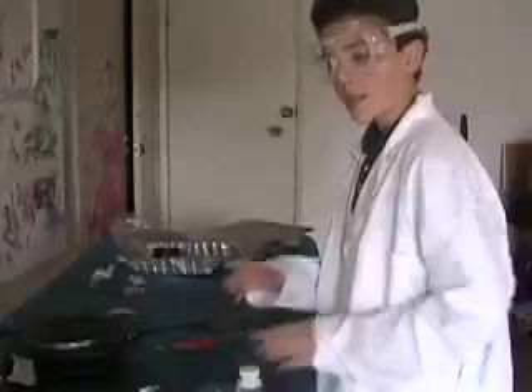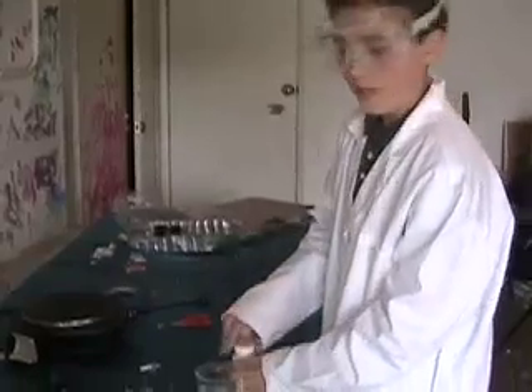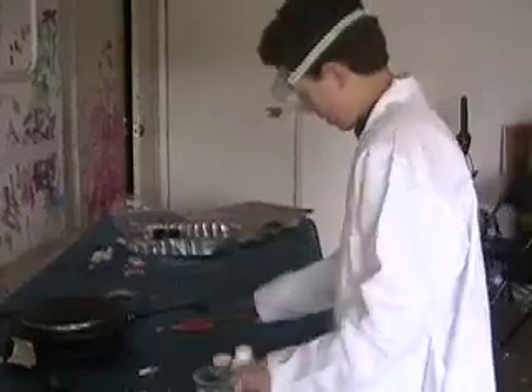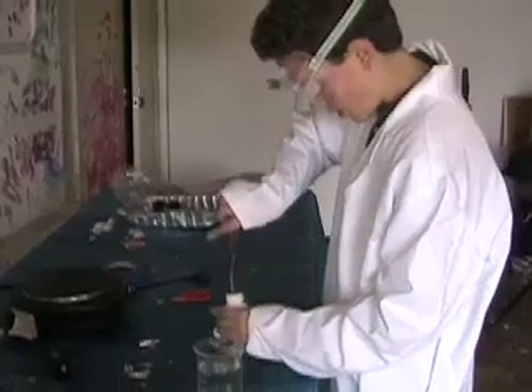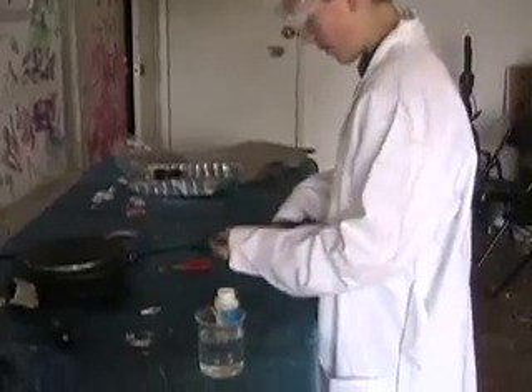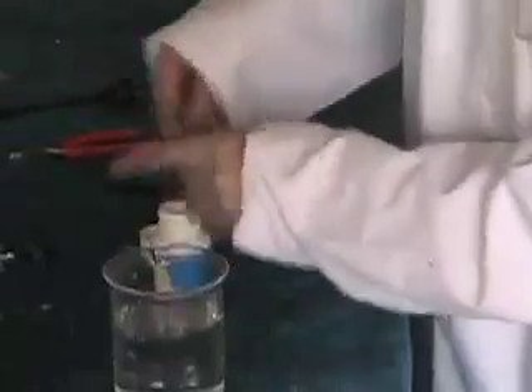So now I'm going to do the same reaction I did earlier, putting lithium in water, except now you can see it better, especially because I have my mom operating the zoom. So I'm going to take out the lithium foil. As you can see, it's super tarnished. I'll unroll it, take off a small piece, and put this back in the oil.